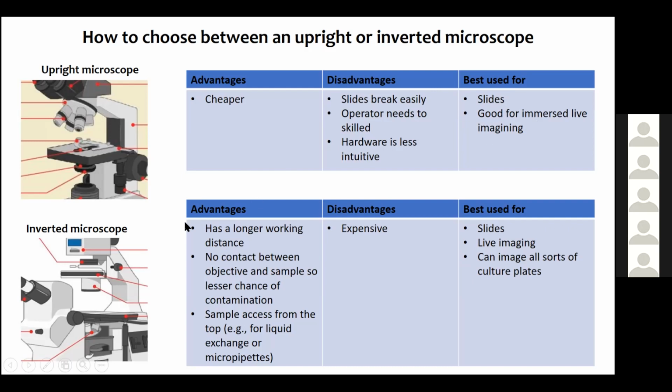So I personally prefer the inverted microscope because even if a person is new at using microscopes, the inverted microscope gives the user a lot more flexibility, because once you are focusing your samples, especially when you're using the knob over here to adjust the focus, you can be a little bit carefree when you're adjusting it, because the chances of you hitting the slides are slim to none, and therefore breaking it is also very less. However, be careful because you can break the platform or the stage.